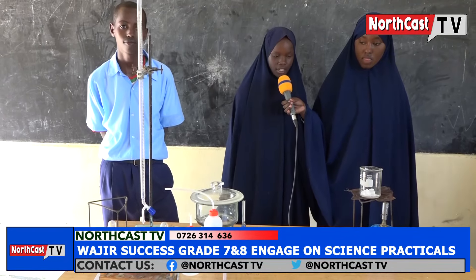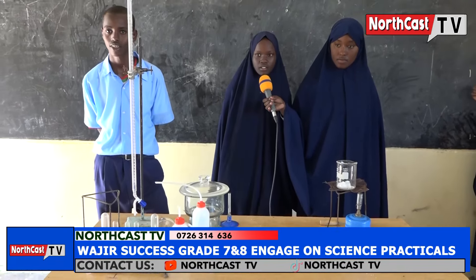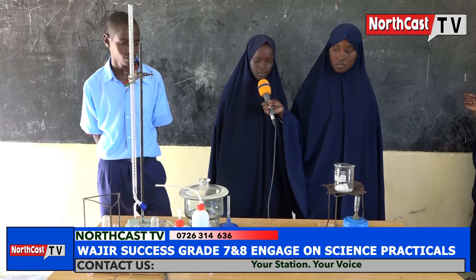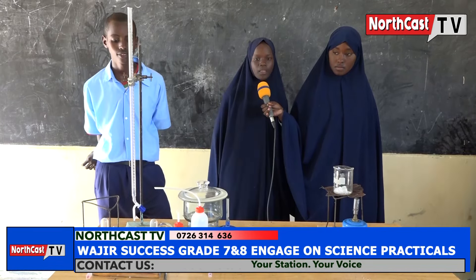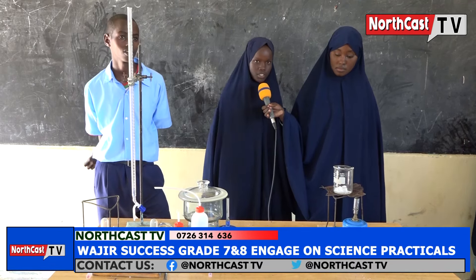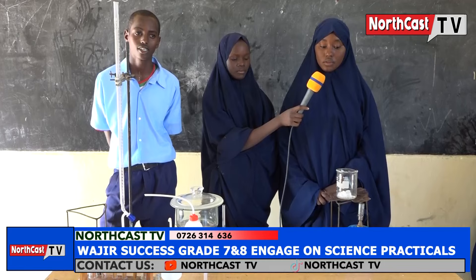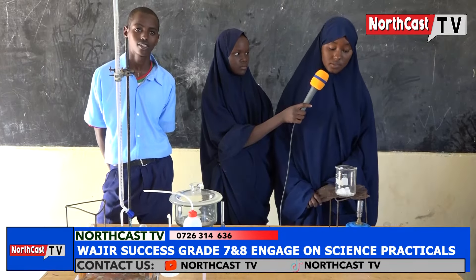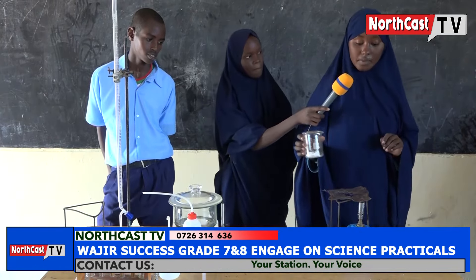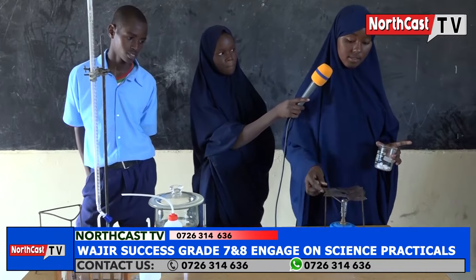My name is Steven Akini. I am a student at OJIA Success Integrated Academy. We are going to carry out an experiment on temporary physical change. Temporary physical change is a change that is easily reversible and in which no new substance is formed. Aisha will take you through the apparatus used. The apparatus used are candle wax, glass beaker, a tripod stand, a wire gauze, and a source of heat.